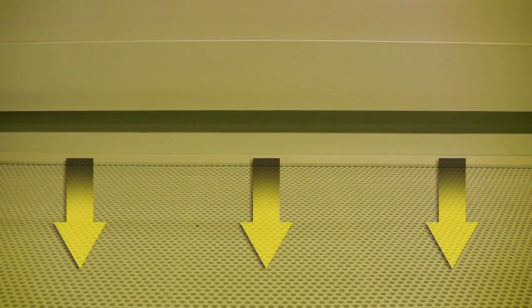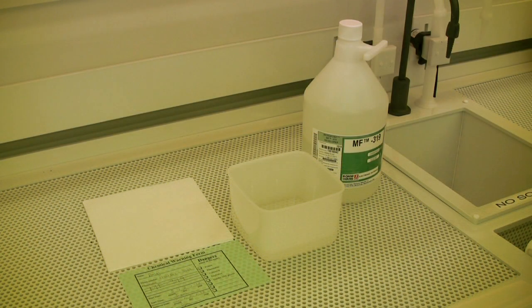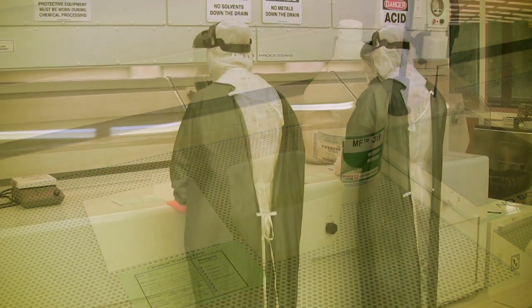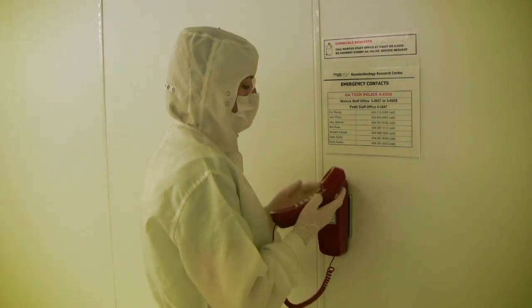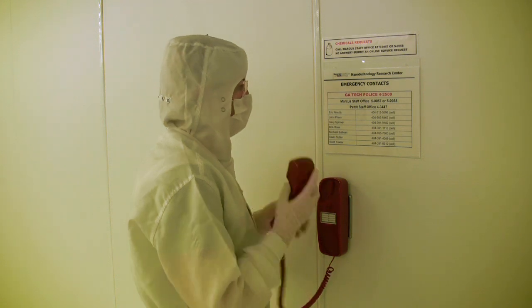Blocking too many of the small holes on the surface of the wet bench or the slotted vents at the back of the hood will impede the air flow and cause the alarm to sound. As a general rule of thumb, you should only have what you need inside the fume hood and nothing else. If you feel that a fume hood isn't working properly, you should notify the cleanroom staff and then find another fume hood to work at.